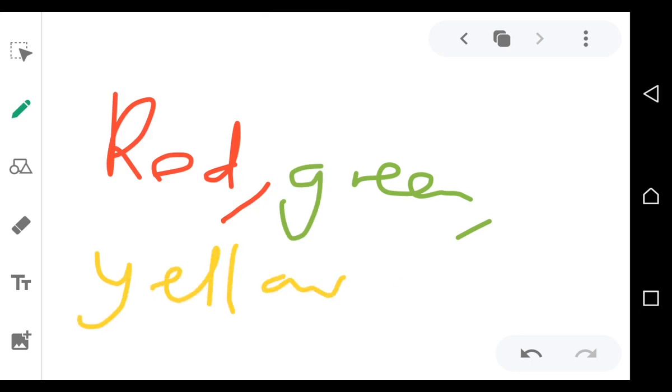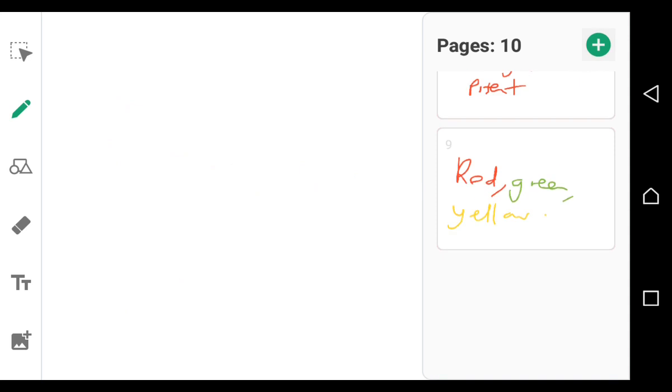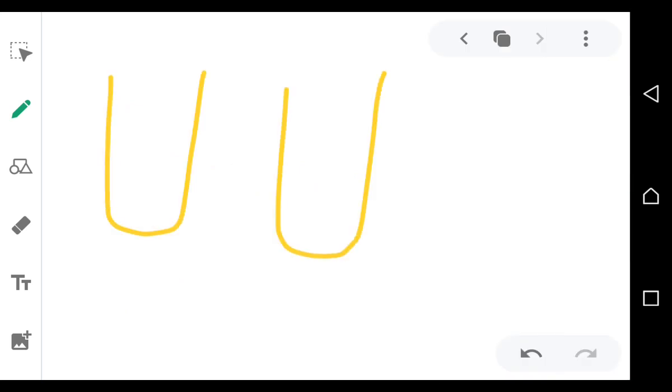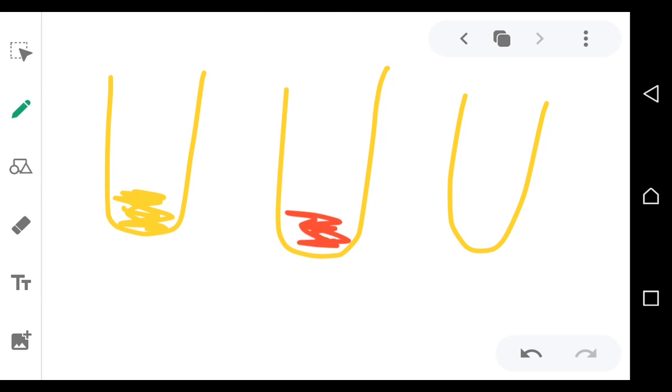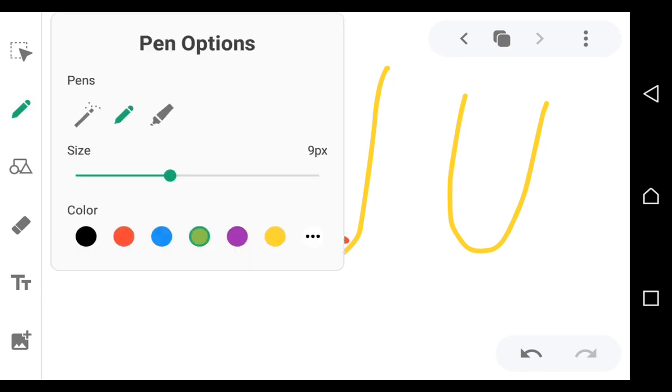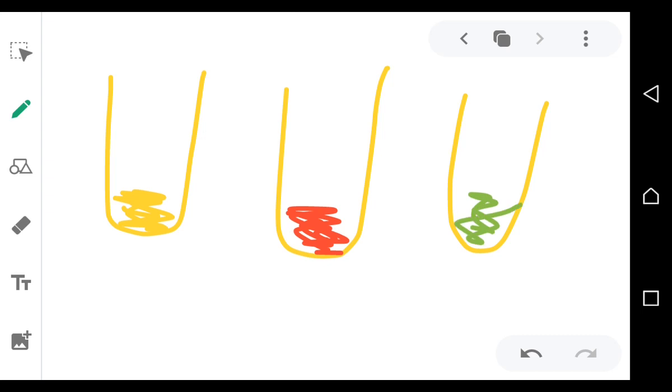Once you see any of these colors in the test tubes after boiling, if the test tube changes to become yellow, or red, or green, then reducing sugar is present. So meaning reducing sugar is present here, here and there. Why? Because there are those color changes. But if you see it's staying blue, know that there is no color change. I mean, there's no reducing sugar.